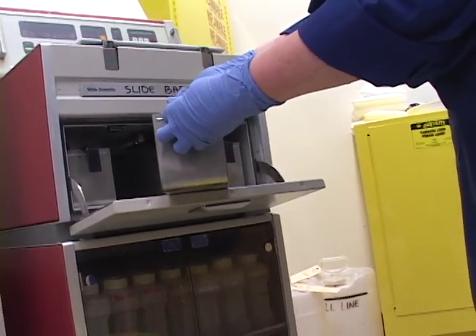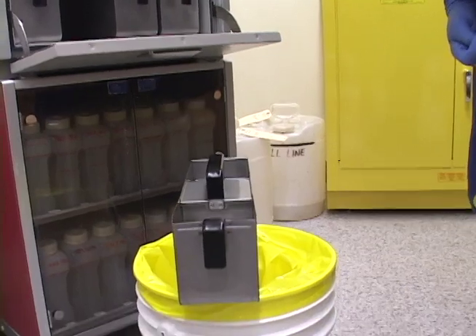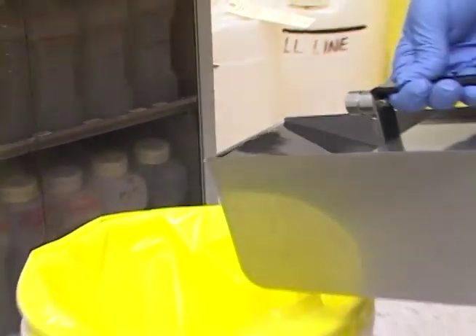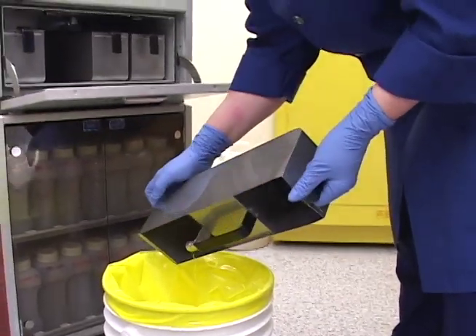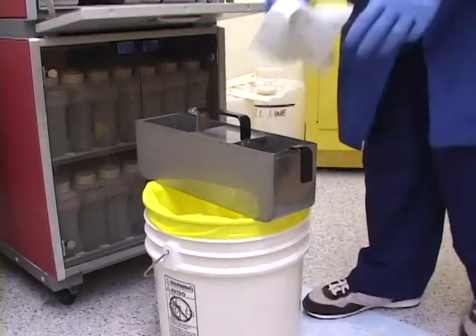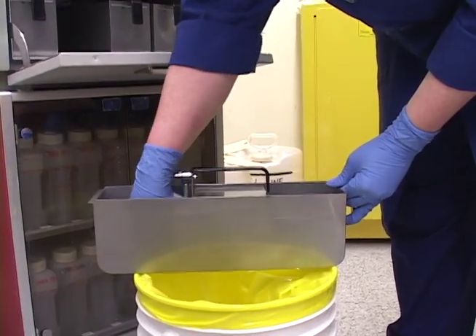There's a fill line inside the bucket — you want to fill it to that line or just slightly below. You never want to overfill these buckets because you'll get an overfill warning, but you certainly don't want to underfill it either because you can get an error code. They smell quite strong of xylene because it's used for clearing out the xylene and infiltrating the tissue with paraffin. I dump it out and give it a little wipe with paper towels. You can tell it's getting old.